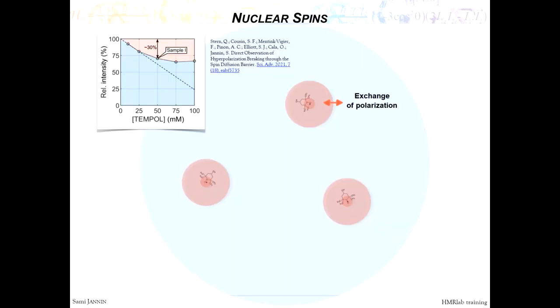So these nuclear spins that are really close to the electron, one thing we know is that they become invisible by NMR. They are so close that they're shifted in frequency, hundreds of megahertz, tens of megahertz. The lines get super broad, so we cannot really observe them. And that's something we observed in this paper, that the more radical you put, the less signal you have without DNP. So before you switch on the DNP, you see that part of the signal disappears in this sphere of influence of the electron, and we call them bleached or quenched.